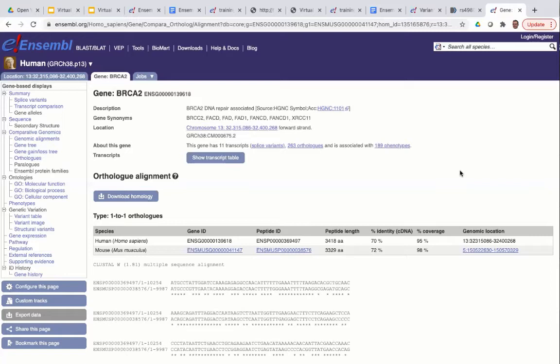And then in the next section of this module, I'll be explaining the whole genome alignments, which is obviously based on nucleotide sequence alignments. If you want more information about protein alignments, I'm not sure of the best resource, but within the EBI, you could probably go to UniProt or use the Clustal Omega tool through the EBI pages that might be able to help you with the protein alignments.